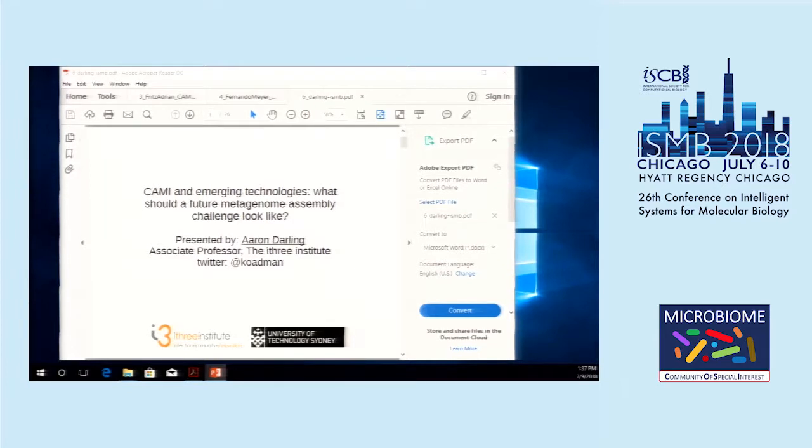I think it's going to be harder to evaluate with long reads because assemblers tend to smash more, and you don't have the nice de Bruijn graph framework operating. Yeah, overlaps get much messier, and I think it'll be harder to evaluate. Yeah, we'll see. We really have to think about it for the next challenge because we are including the long reads, and then we see how to evaluate.